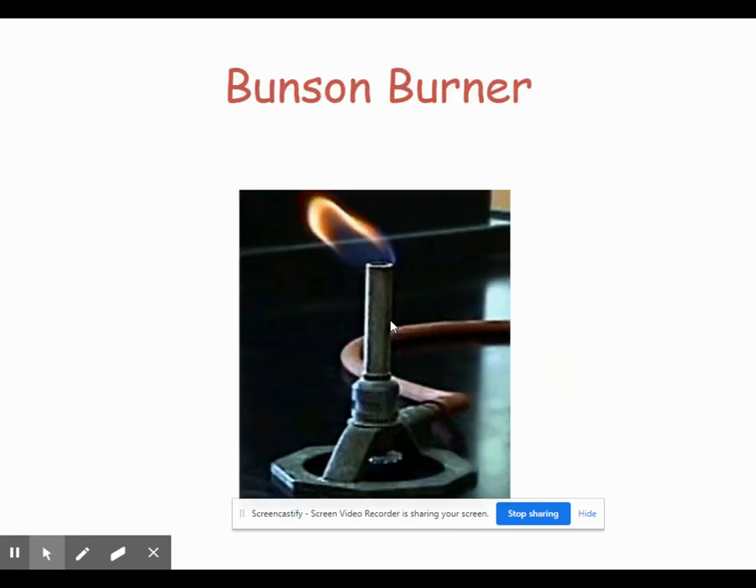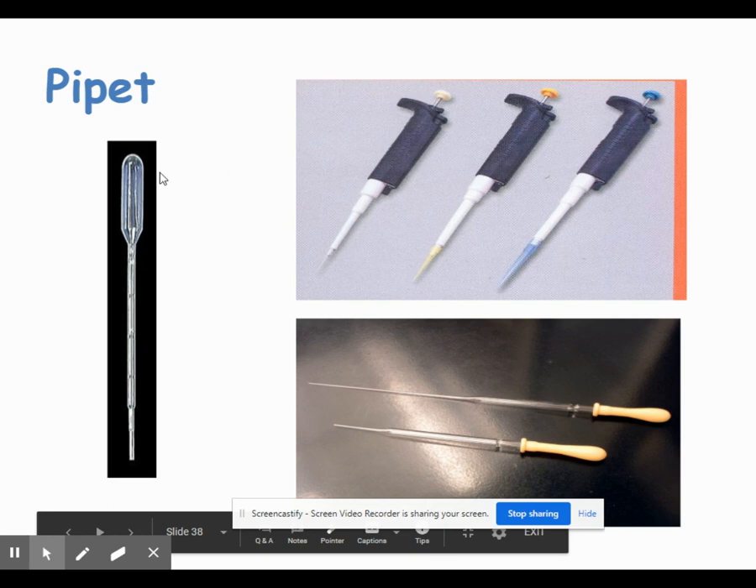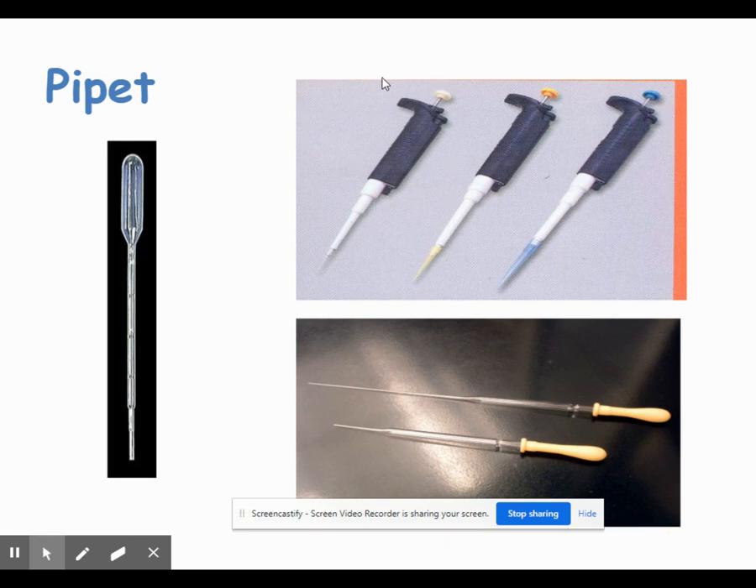The Bunsen burner we'll use in lab several times. There are three types of pipettes we'll use. The disposable pipette and the Pasteur pipette are used to transfer liquids — to get a small amount and add a few drops. Then we have micropipettes, which are very accurate and can measure out specific amounts of liquid. If we need to measure half a milliliter, for example, we can use a micropipette. If we just need to add a few drops of water and the true amount doesn't matter, we can use the little disposable pipette — you might also call it an eyedropper.